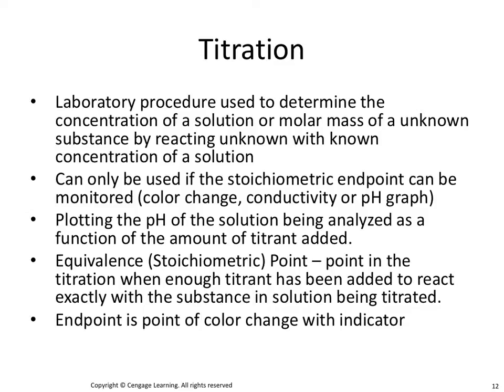So it says laboratory procedure used to determine the concentration of a solution. So let's start there. It's a lab procedure used to determine the concentration of a solution or the molar mass of an unknown substance by reacting an unknown with a known.